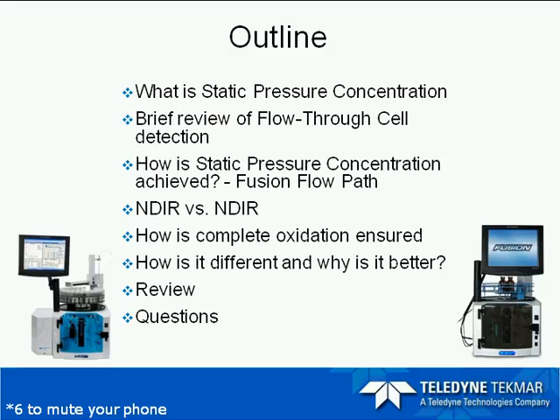So we're going to go over our outline, and just to give you a little background on me, I've come basically out of the environmental and pharmaceutical fields, and I've been here at Teledyne for the past 3 years, and as Betsy mentioned, I'm the applications laboratory manager. So to begin with, we're going to cover basically what is static pressure concentration.